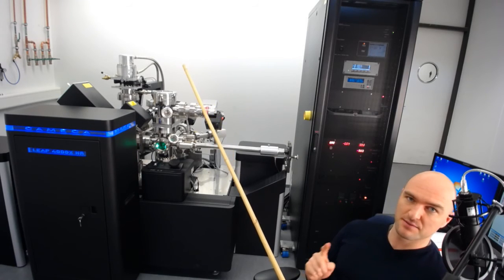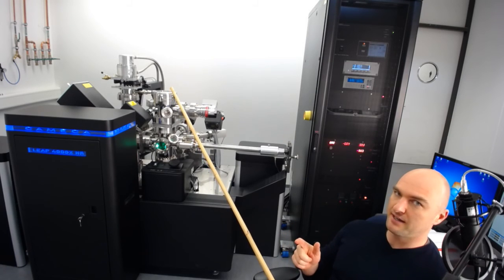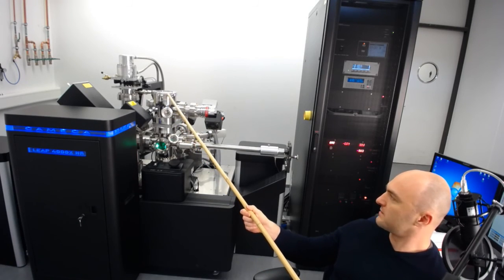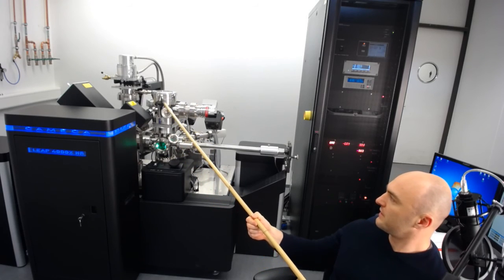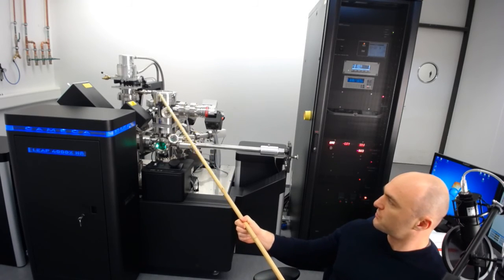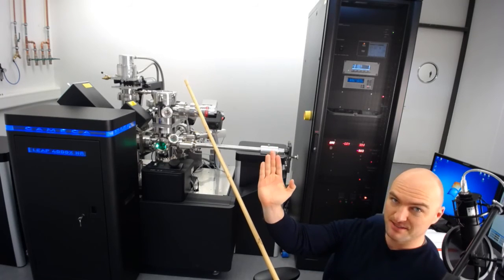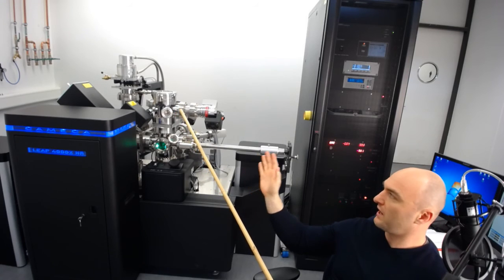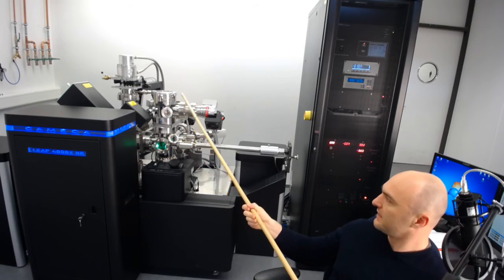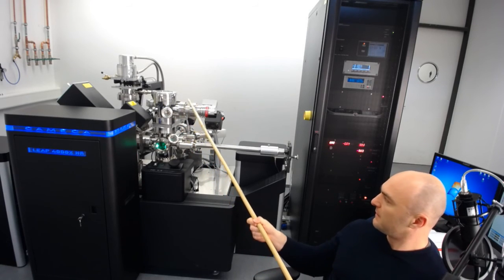The turbo pumps won't spin above 1500 Hz, but if they spin below 1500 Hz, that means you've got a leak — which would not be good at all. We have a load lock with a quick access door used to put samples in. The quick access door has a knob, but on the LEAP that knob is only there so it can be mounted sideways — it doesn't actually serve a sealing function here. So just let it dangle off to the side.